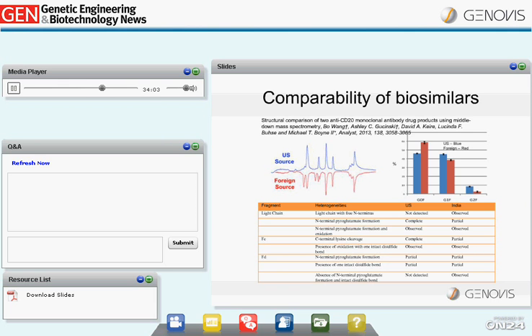Other post-translational modifications associated with the light chain, single-chain Fc, and the Fd fragment could also be distinguished between the two. So in summary, it proved suitable, using this straightforward middle-down LC-MS approach, for the identification of structural differences between the drug products from two different international sources.